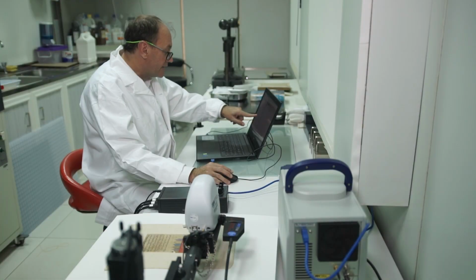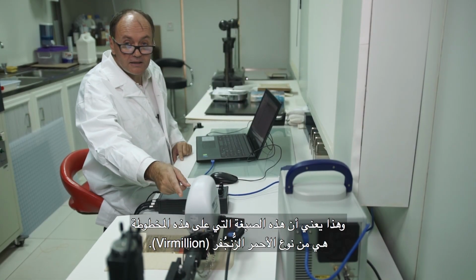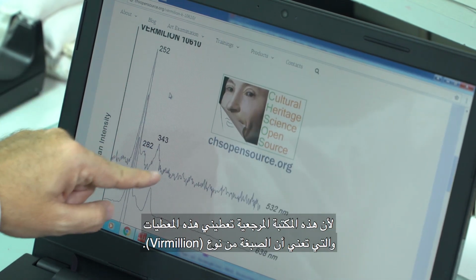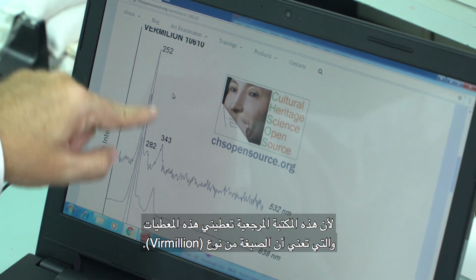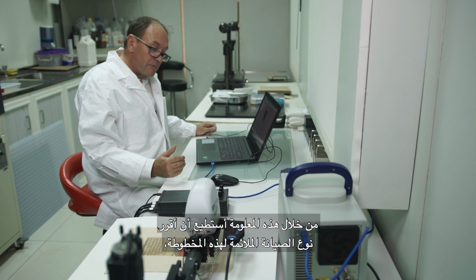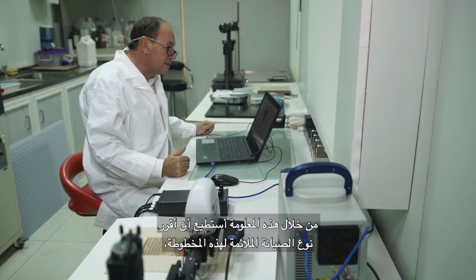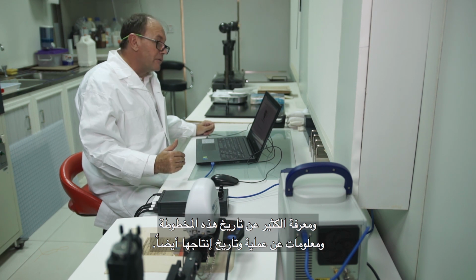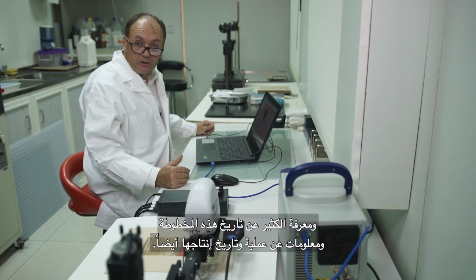So I can now say that this pigment on this manuscript is a red vermilion, because I have a reference library which gives me the information that with this kind of peaks, it's a red vermilion. So from that information, I will be able to decide about conservation treatments, and we will know much more about the history of this manuscript, information about its production, the date of the production also.